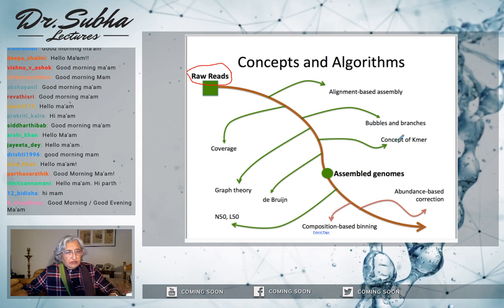the concept of k-mer was developed. This k-mer, you will hear it everywhere. Whenever you talk about assembly, you will talk about k-mer, no matter what you're assembling. No matter whether you're assembling a genome, metagenome, whatever, you need k-mer. Because without the concept of k-mer, we could not assemble the genome today. Even with the most loaded computer, with even 1 terabyte or 2 terabyte or 5 terabyte of RAM, you cannot assemble the genomes because we get so many fragments. So the concept of k-mer is important.